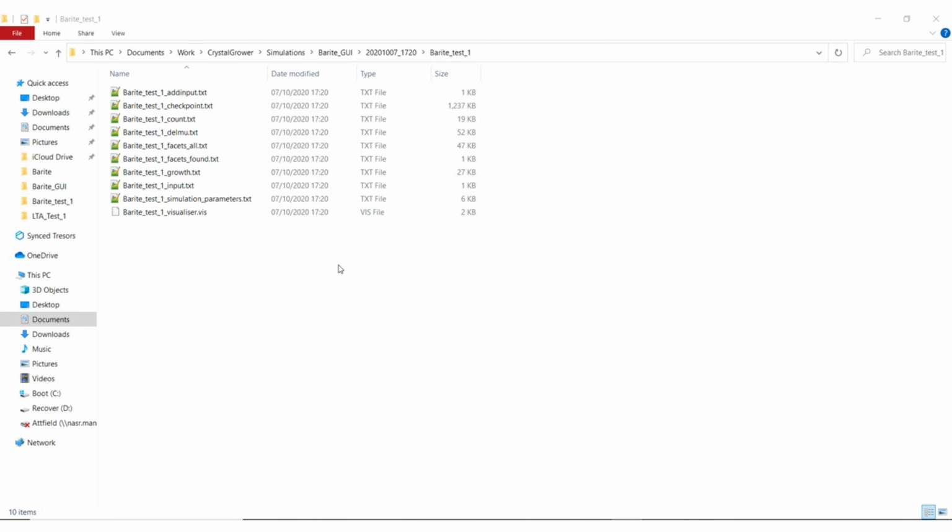So in this video I'm going to cover the output files from Crystal Grower. There are detailed manual pages explaining the format of each of these files, so I'm not going to go through that in detail in this video. I'm just going to give a general overview of each file and how you can use it effectively.